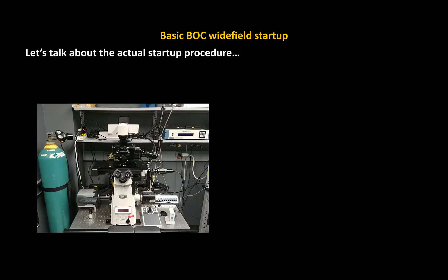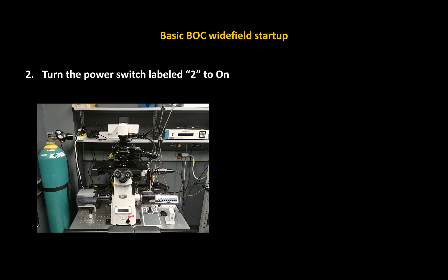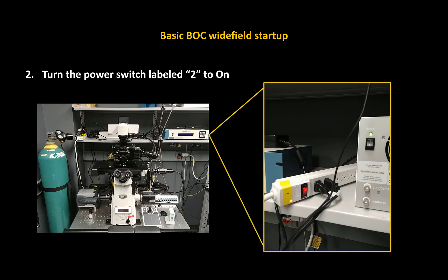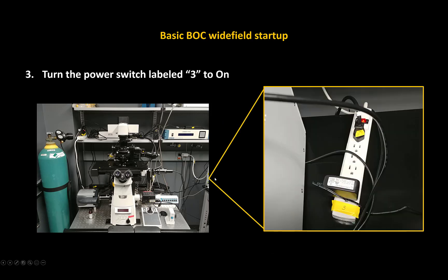Let's talk about the actual startup procedure. The first thing you're going to want to do is turn the power switch that has a yellow piece of tape labeled one to on, and that's located right here. The second step is to turn the power switch labeled two to on, which is located just out of shot. The third step is to turn another power switch just to the right of this large white box, labeled three. That completes all the power switches you have to turn on.